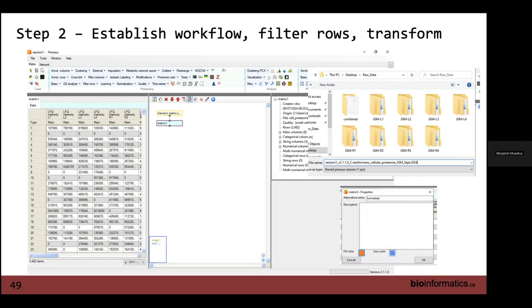Good, awesome. All right, yeah, so it can be saved as an SPS file. That's really nice because the SPS file contains all of this information as well. They can get quite bulky, but it's really nice if you're working with someone or sending things to a collaborator or your supervisor, saying, hey, this is the analysis I did. You can follow my pipeline, make sure everything makes sense.